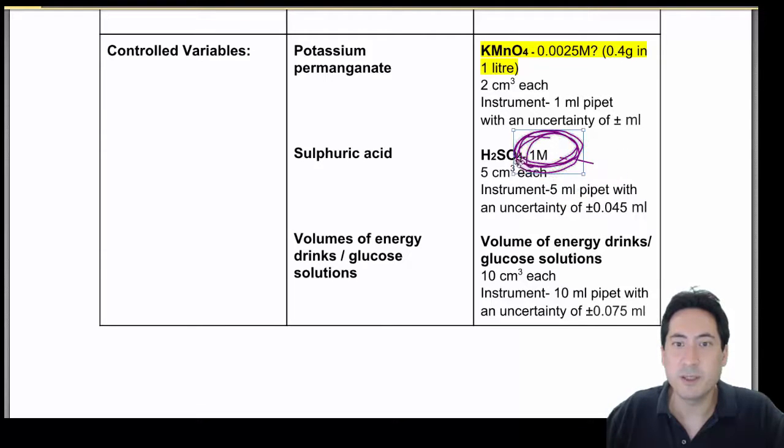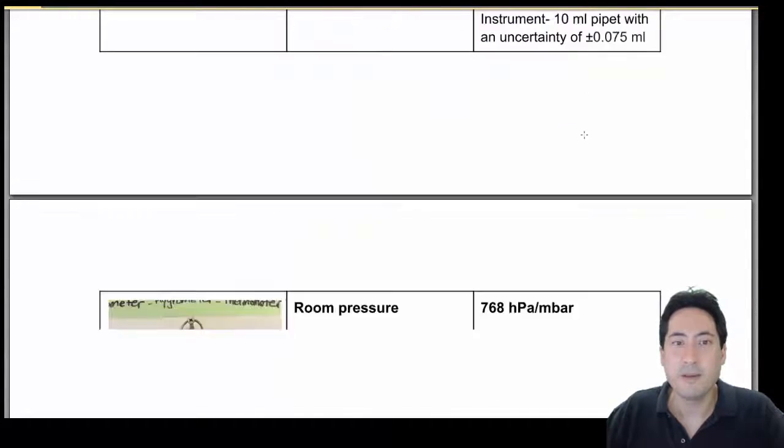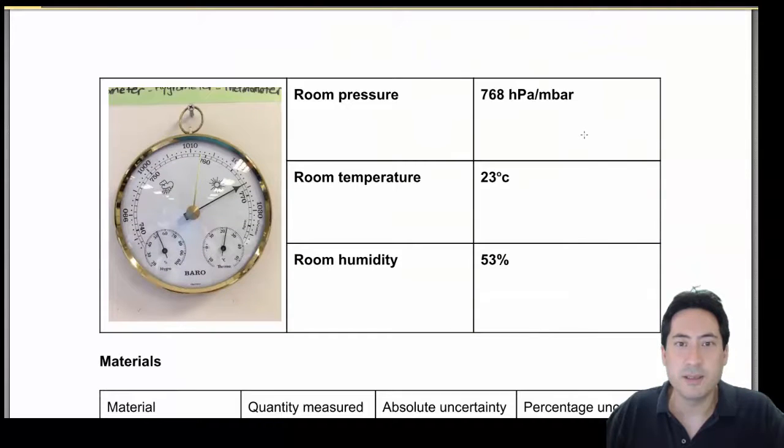Go to the top right hand corner right now, I've got a set of 4 titration videos that show how to do the titration calculations, and the first one shows you the bottle with all the errors on it. I did tell everyone to take pictures of the bottles of their reagents, because that's relevant too. This is probably 99% or worse. So let's look at that.